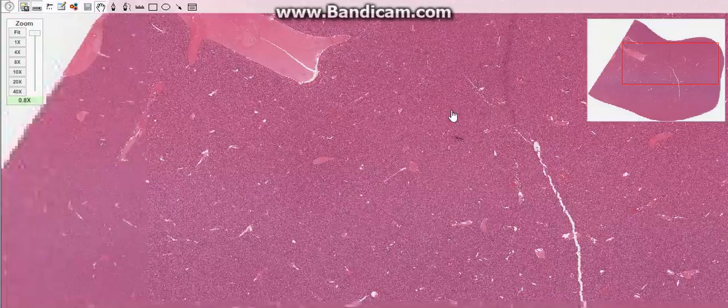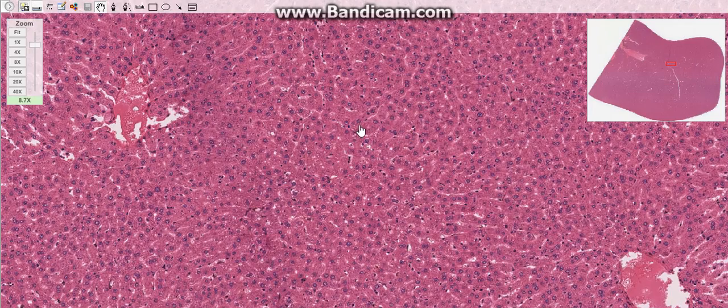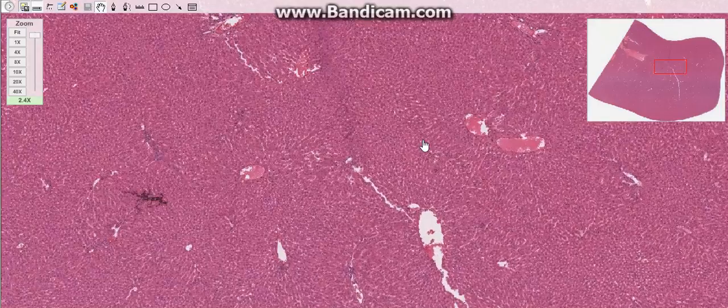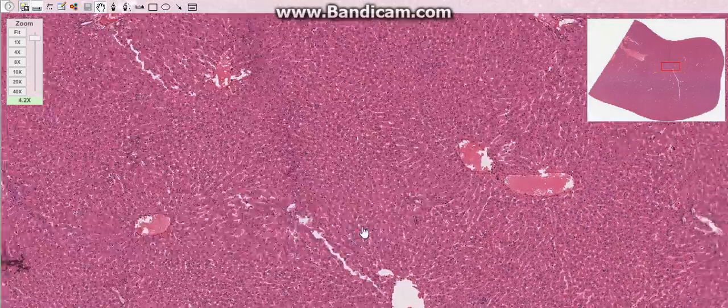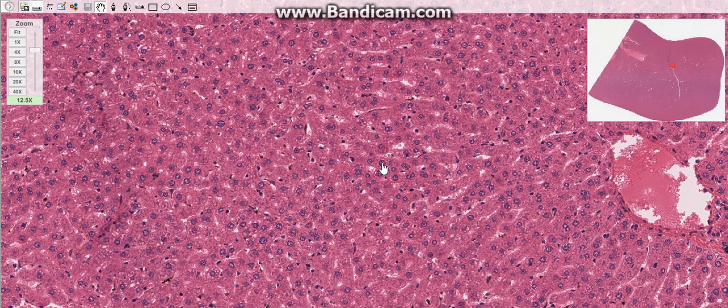The liver consists of hepatocytes, which are the basic structural component, and it also has basic structural units. These are the liver lobules. Within each lobule, as you can see here in this slide, this is the liver lobule, and this one too is a liver lobule. There are also the hepatocytes, as I just told you. These are the basic structural component. You can see them here, hepatocytes. All these small cells are called hepatocytes.